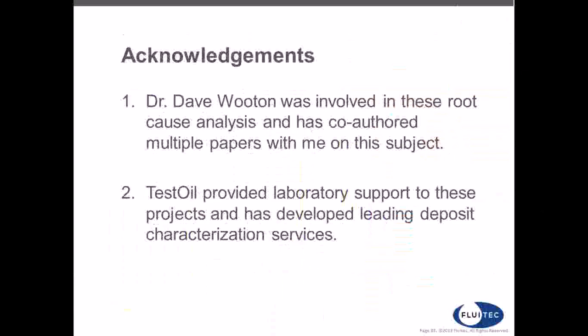So that's another thing to consider as well. Like in the EHC application or the case study that I showed, microdieseling was in fact not occurring. It was a very high temperature, localized high temperature event that caused the fluid to degrade. And so those are two areas that I would consider pursuing in your investigation. Ultimately, you should get a sample of the deposit to your lab to do some further analysis.